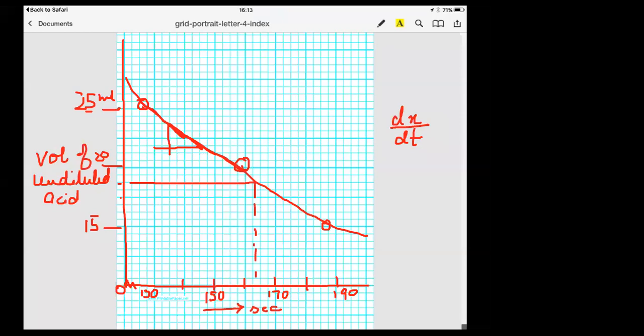So for various concentrations, you can get the values. Now remember, it is not necessary that all the children will get the same values. It may depend, because sometimes the size of the magnesium strip may vary. Sometimes when you are diluting it, you are not very precise with adding the water, so a little more water may be added, or the solution may be a little more concentrated.